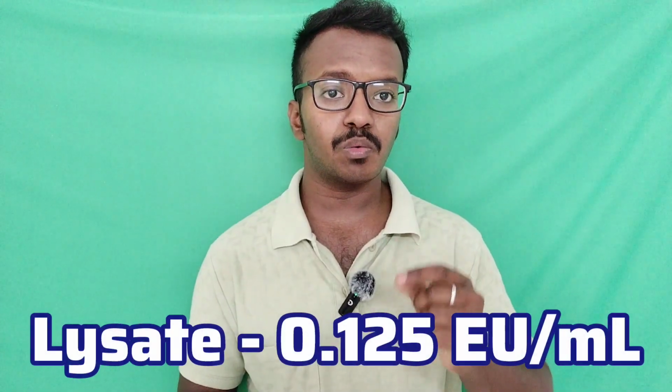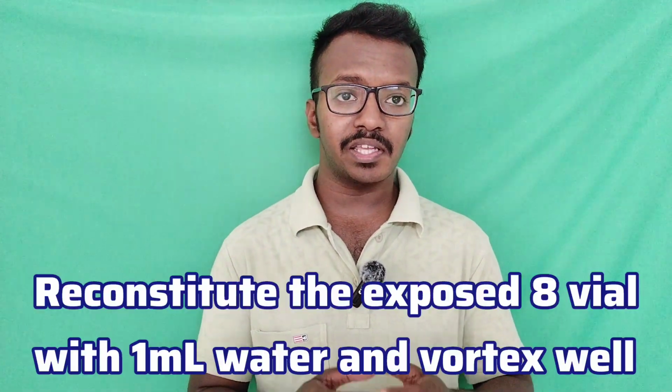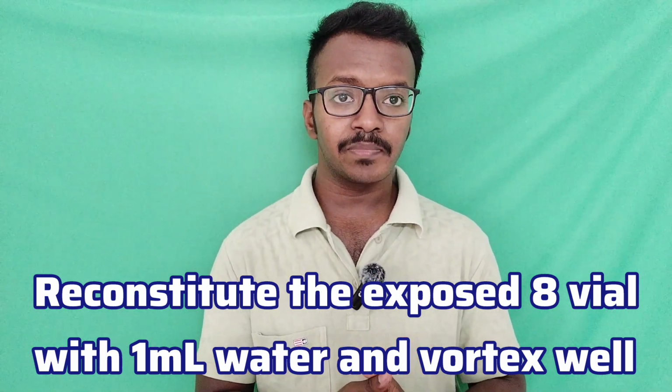In this test, we are using a lysate sensitivity of 0.125. So based on the 0.125 lysate sensitivity, we need to prepare a standard curve as shown in this image: 2 lambda 0.25, lambda 0.125, lambda by 2 0.0625 and lambda by 4 0.03125. At the same time, reconstitute the exposed or baked 8 vials with 1 ml endotoxin free water and vortex for 10 to 15 minutes, and reconstitute the lysate also based on the COA. Now we have prepared the standard curve and the 8 samples. Our samples are ready for incubation.